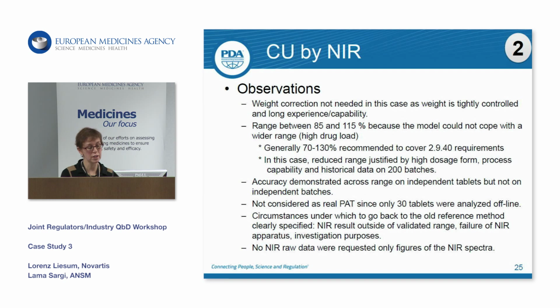And to conclude with the observations, we did not request any NIR raw data because we do not perform a recalculation of the model. We considered that typical NIR spectra were sufficient in the application.